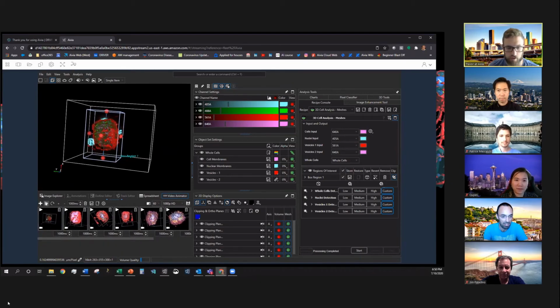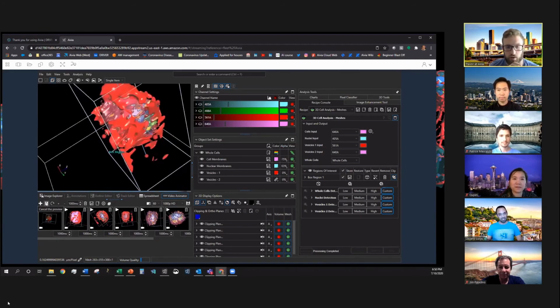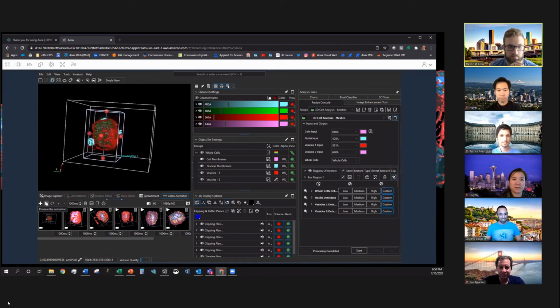So what do you think, Luciano? If I preview this, the timing's not right yet, but as a video showing what you've done, it's not too bad, right? That looks pretty good.